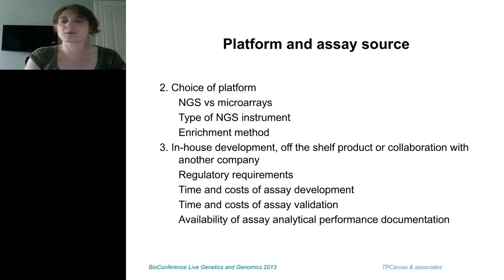So off-the-shelf products do not work for every lab. You can work with a different company that will help you with their expertise to develop the LDT. And with all of this, you have to really look at the time and the cost. And very importantly, is there any documentation from the companies?